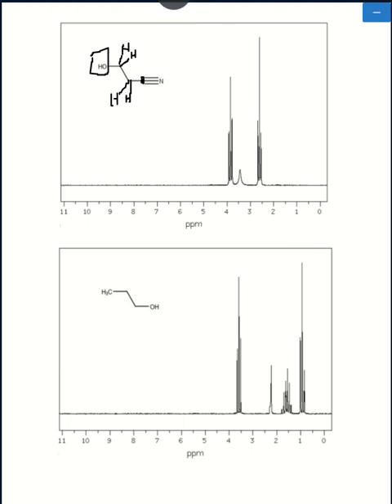Now, when it comes to hydrogen that are not being shown, the only time that there are invisible hydrogen is when they're connected to a carbon. If hydrogen are connected to an oxygen, a nitrogen, or a sulfur, those would be drawn in. So in this case, on the nitrogen all the way on the far right, there are no hydrogen drawn in as bound to that nitrogen. Therefore, there are no hydrogen connected to that nitrogen, so it will not show up on the NMR spectra.